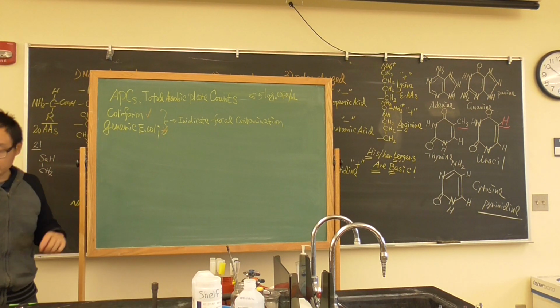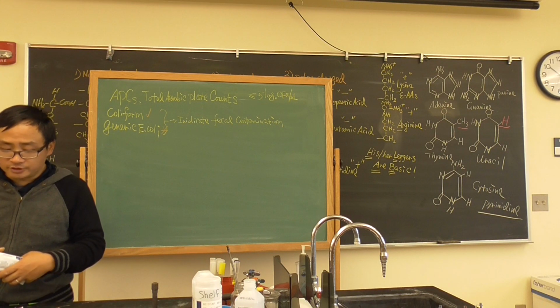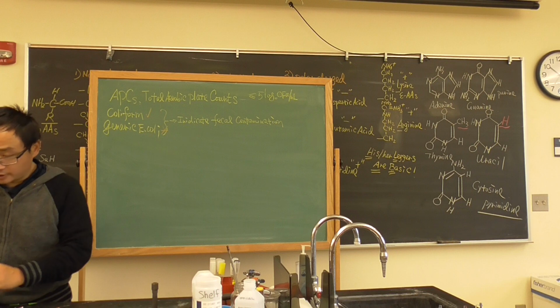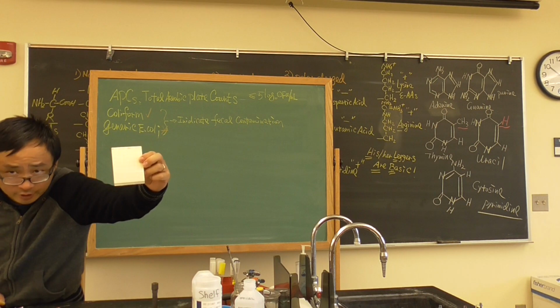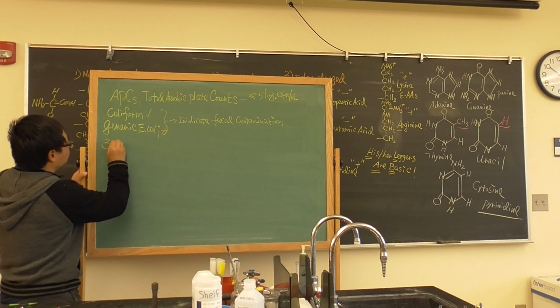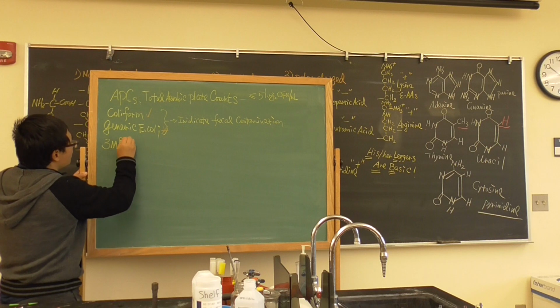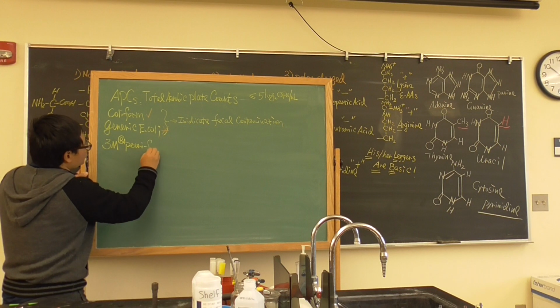Today there's a little bit of difference from what we did before. Instead of using an agar medium, we're going to use a paper medium. It's very nice, called Petrifilm. All these products are called 3M Petrifilm because they're made by a big company called 3M.